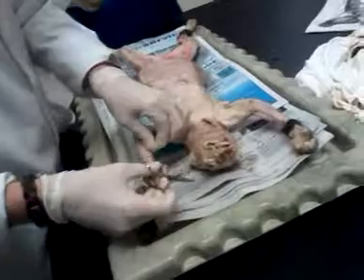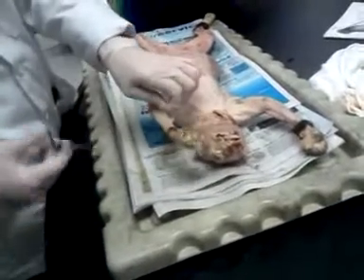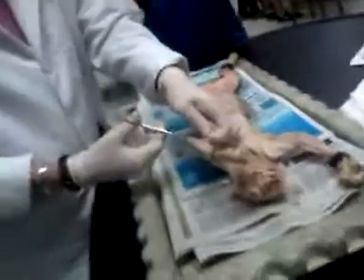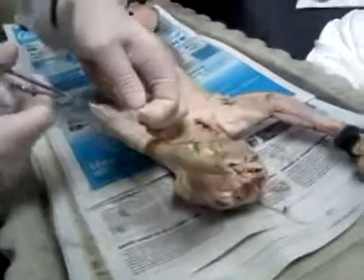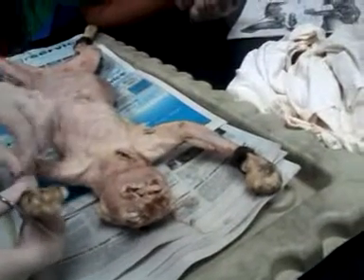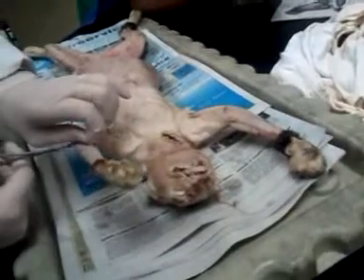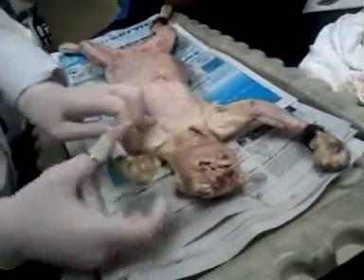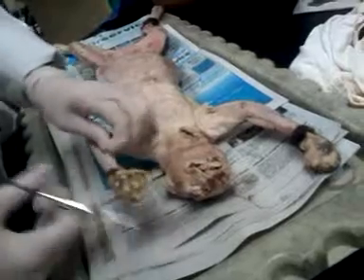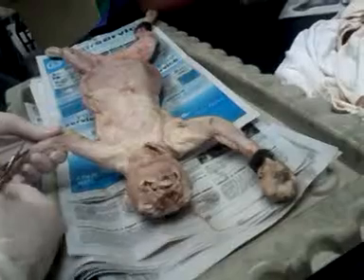Yeah. All right, everybody see the epimysium? Yeah. See it right there? See, look, see it? So what I'm going to do is cut it. This one's not bad at all. And I'm going to peel it off. No wonder it wasn't bad. I didn't go deep enough. That's it. See it right there? You just got to slowly cut that off. Oh, yeah, but once I get it started, it's easy. There it goes.